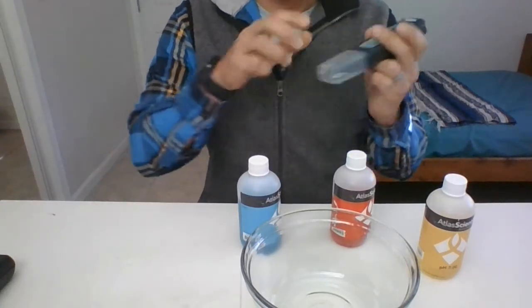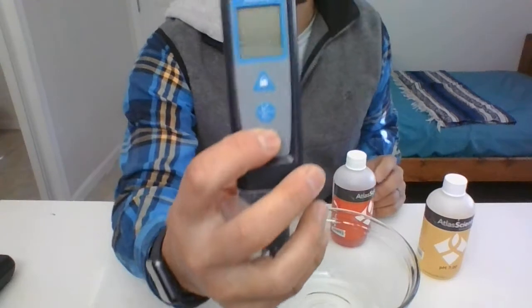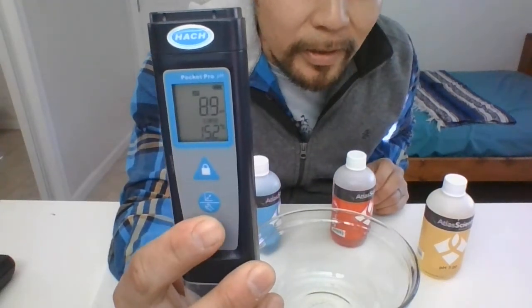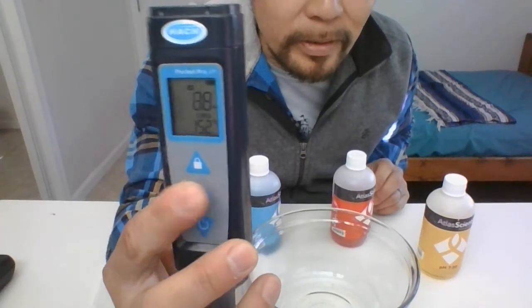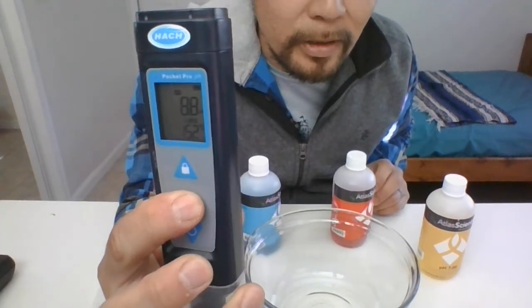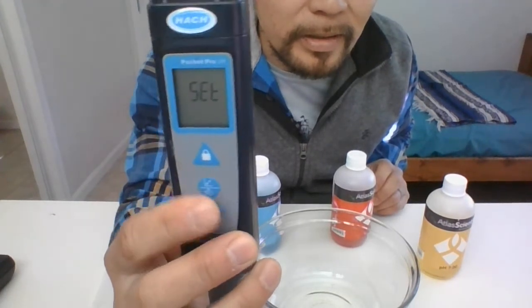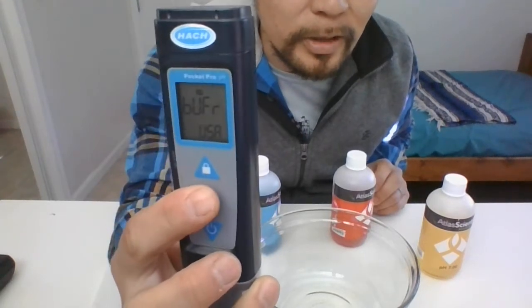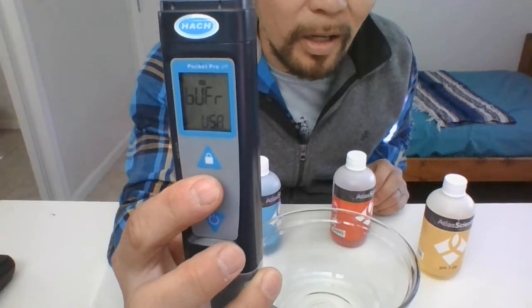Now you know what equipment you have. To get started, go ahead and turn on your pH reader. Once it's on, make sure it's ready to be calibrated. Hit that circle button, hold it down, and then it says 'Select' — go ahead and hit the circle button one more time. It says 'Units.'